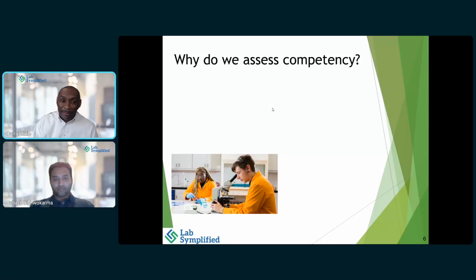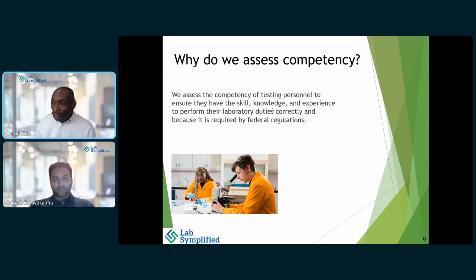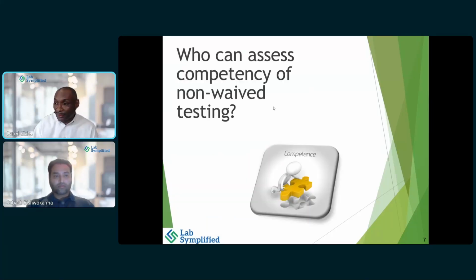So why do we assess competency? Many of us know we assess the competency of testing personnel to ensure they have the skill, knowledge, and experience to perform their laboratory duties correctly. And also because it's a federal regulation. Absolutely correct. CMS, Medicare, and Medicaid are the biggest payers of our healthcare costs, so we want to make sure we meet all those standards so that we do not get cut off. If you want to see a hospital administration's hair catch on fire, talk about the feds showing up, or us being at risk because of findings of an inspection. That can become a very intense situation.